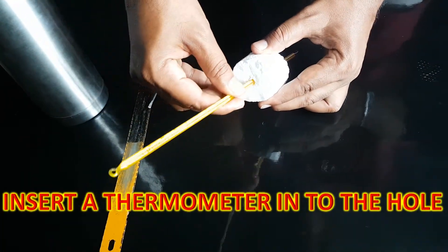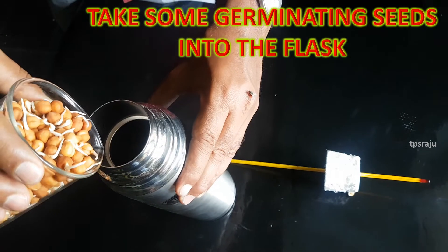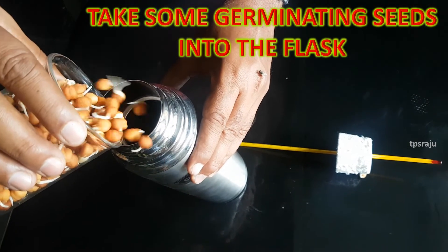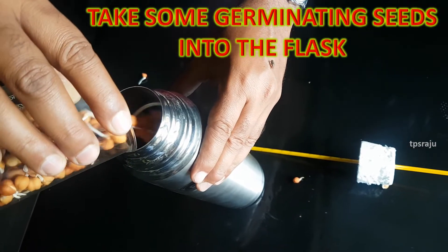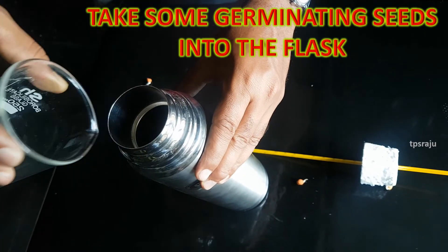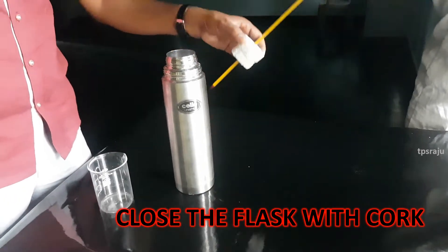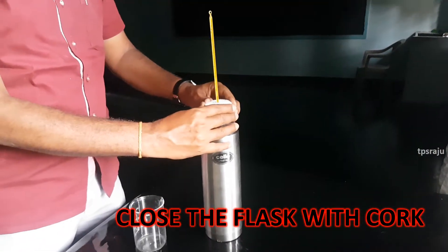Insert a thermometer into the hole. Take some germinating seeds into the flask. Now close the flask tightly with the cork.